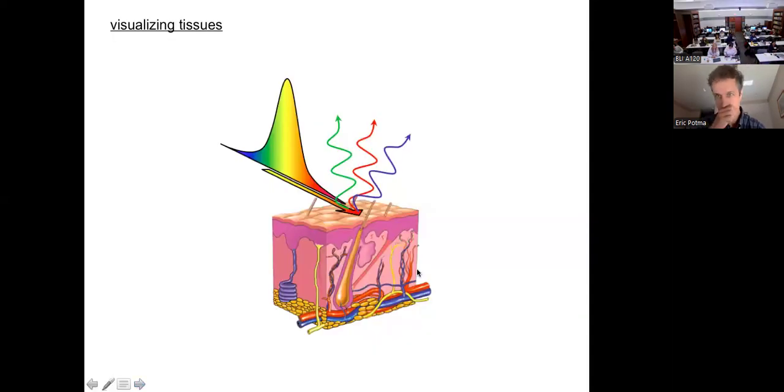Okay, so what is the general idea? It's very simple. We have our biological material. It could be anything, but let's say a piece of tissue, in vivo, ex vivo, it doesn't really matter at this point. And we'd like to know what's in it. What is the morphology, but also maybe, where are our favorite bio components? For instance, a tissue component that you're interested in. Can I see it? Where is it? How does it behave? Is it chemically altered? Is it in a disease state, or is it healthy?